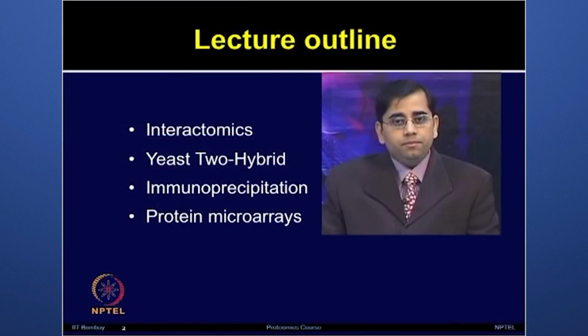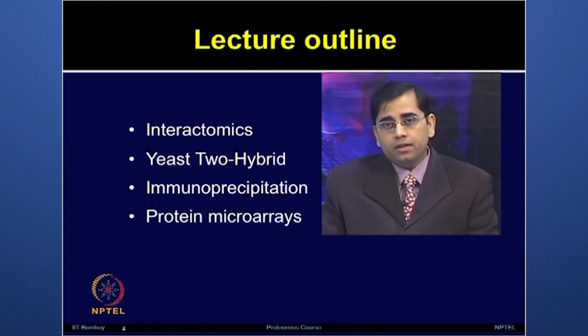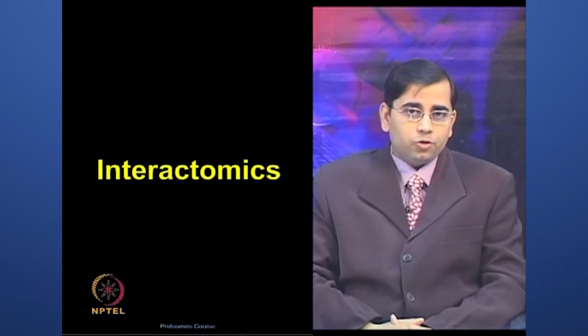So, in today's lecture, we will discuss what is interactomics, different ways of studying interactions such as yeast two-hybrid, immunoprecipitation, and then we will move on to the high throughput approaches such as protein microarrays. So, let us first start with interactomics.